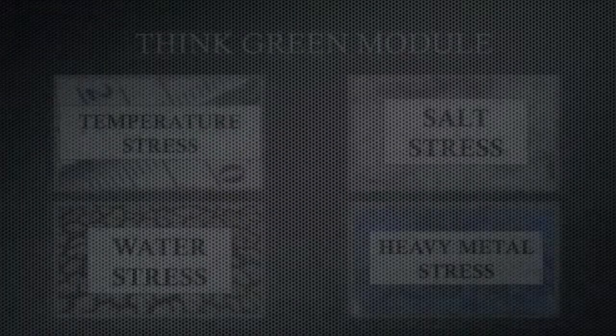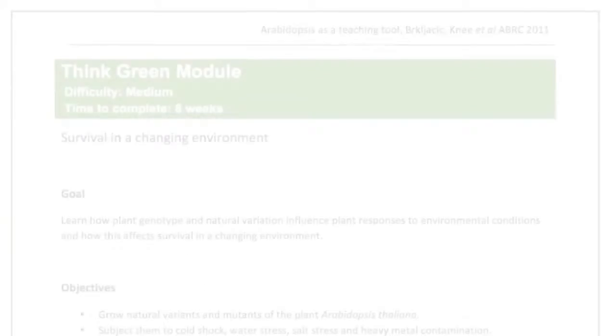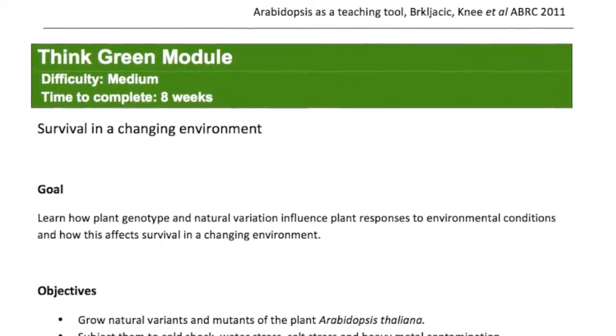After about 4 weeks of growth, you're ready to start treatments. This video will give a short description of each treatment. For more details on the experiment, including timelines and chemical concentrations, please see the Think Green protocol.